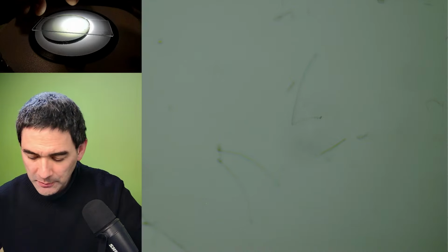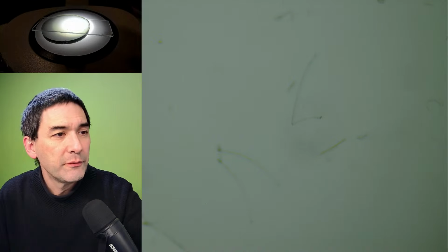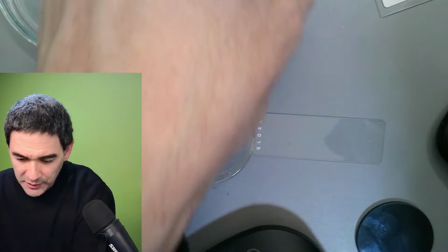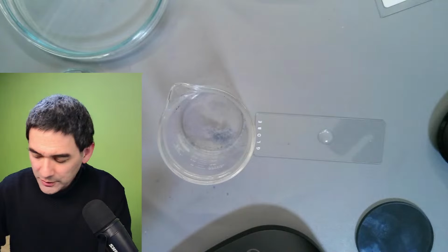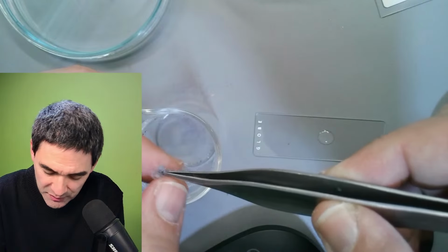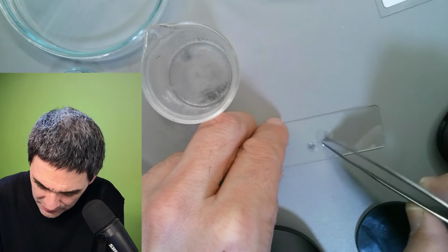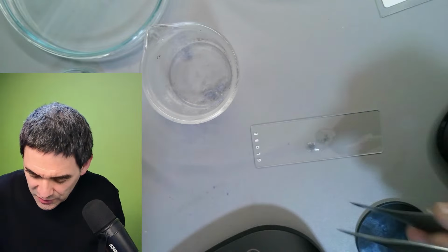They might be natural, but I do have a dust sample here. That's basically just some dust from my desk. I'm going to do the same thing as before, add a little bit of water here, and suspend a little bit of this dust, which is probably going to contain a lot of other stuff as well besides fibers. What I want to do now is really spread this apart, which can be a little bit difficult sometimes because it likes to stick together so much.